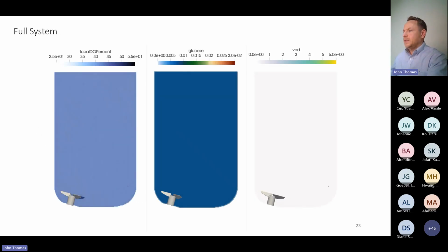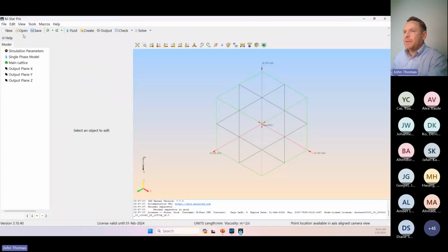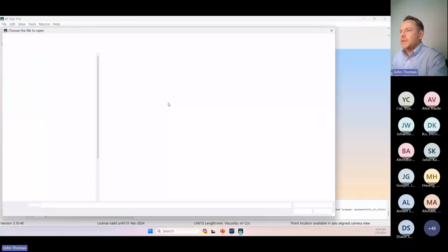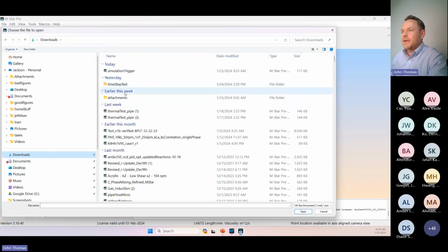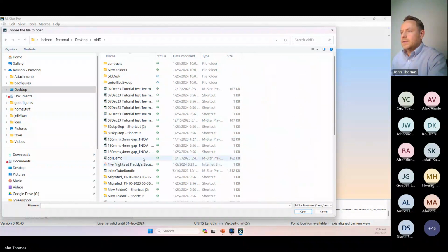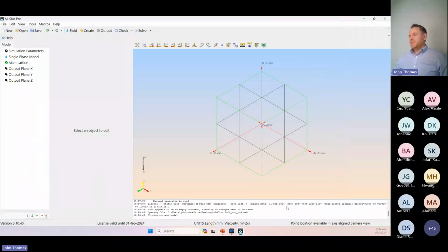I have a closing slide, but I'm just going to go real quick just so people can see. I've got 1 minute or so. If people want to see and play with this model, I'm more than happy to share some of these key components. Let me go ahead and find it real fast. Just 1 second here. I should have had it up, but I restarted my computer because I didn't want to have any sort of competition for my resources.